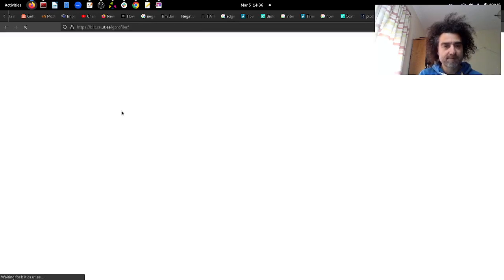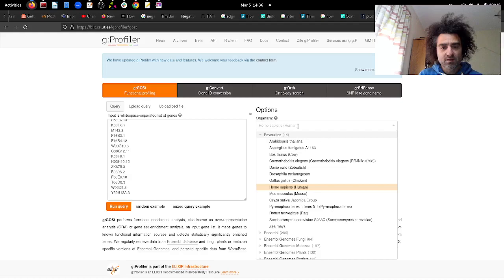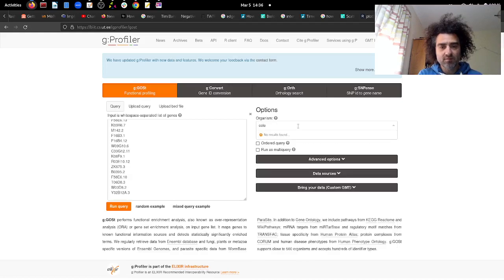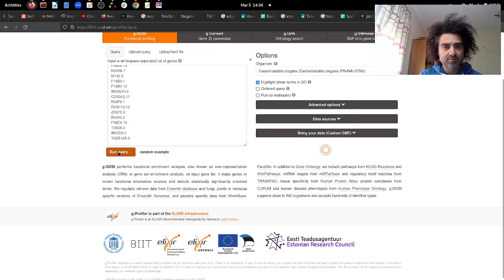Go here. I paste the set of genes. I choose C. elegans because this is my organism. Okay. I just click Run Query.